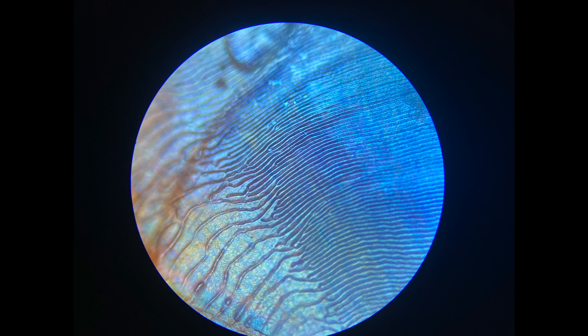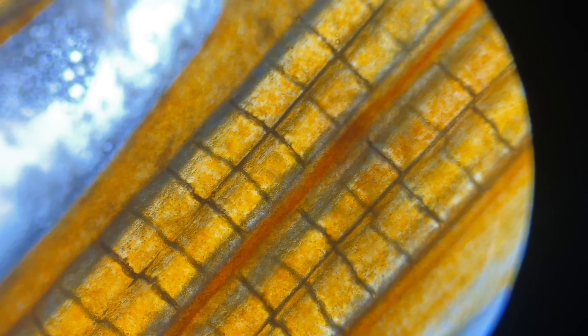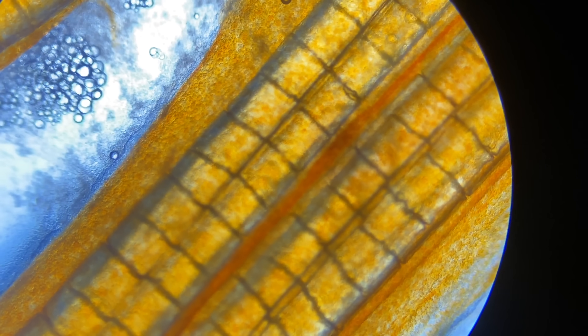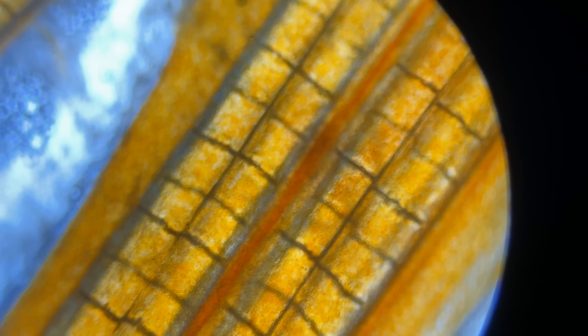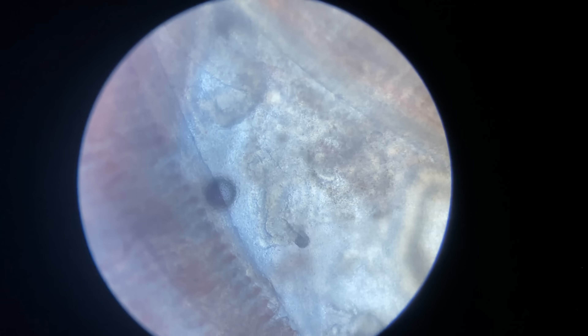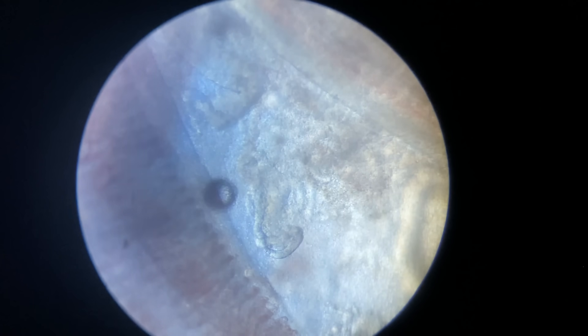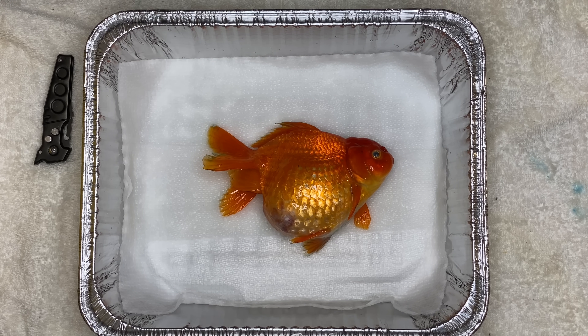I also put various parts of her body under the microscope to check for potential parasites or infections. Her scale is interesting — it kind of reminds me of a fingerprint. On her scales and slime coat, I did not find any parasites or protozoa. I looked closely at her fins as well and did not find any parasites or major infections. However, I did put a sample of her gill on the microscope, and I found what I believe to be a gill fluke. A closer look confirms there's clearly a parasite in her gill — your normal gill fluke. I didn't find very many, and though a gill fluke can be harmful long-term and cause some stress, I don't think it would cause all these serious problems in Viola.